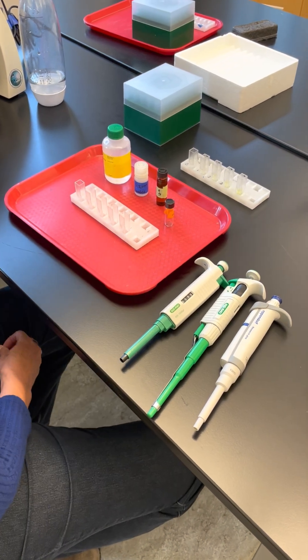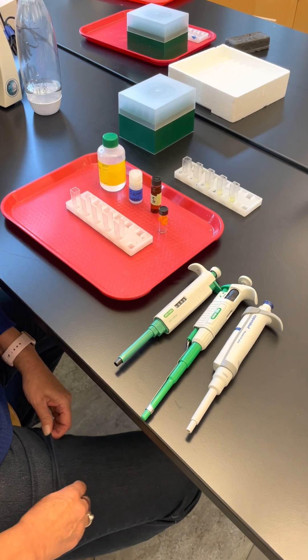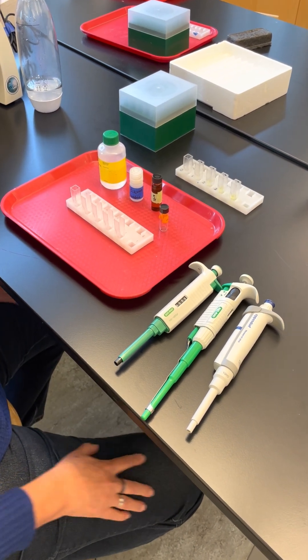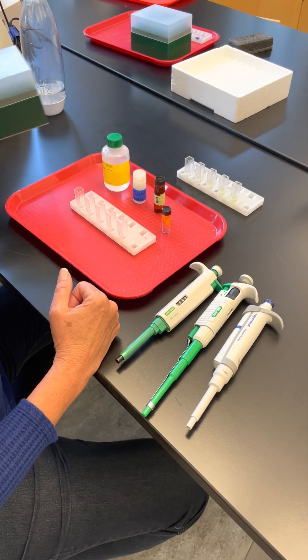This is an enzyme lab. We're going to be studying the rate at which the enzyme works. The enzyme we're studying is cellobiase, otherwise known as beta-glucosidase.